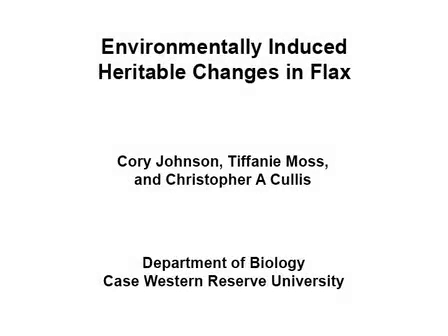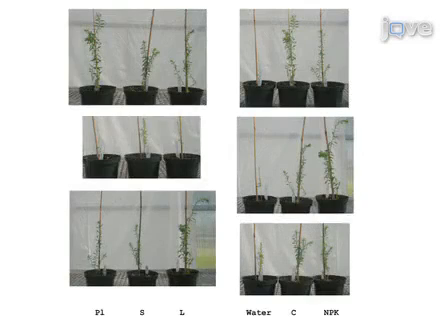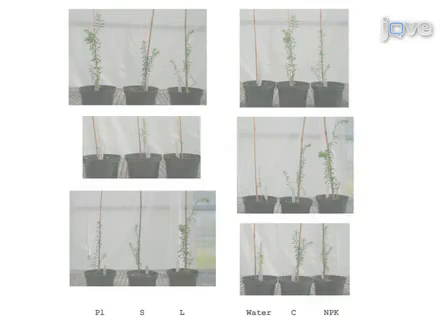The overall goal of this procedure is to demonstrate a method for growing an inducible flax variety under conditions that result in heritable genomic variation. Furthermore, genomic changes are monitored, and the growth of the induced plants in subsequent generations is observed under the various environments. To accomplish this, flax is grown under a variety of inducing conditions.